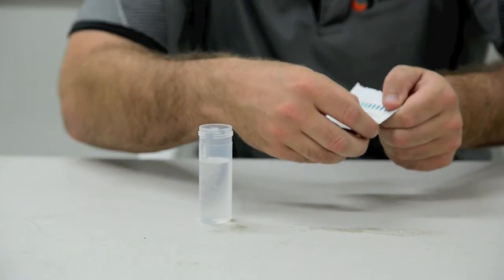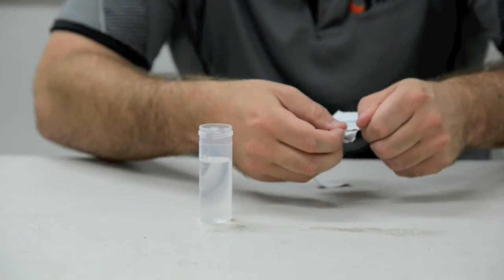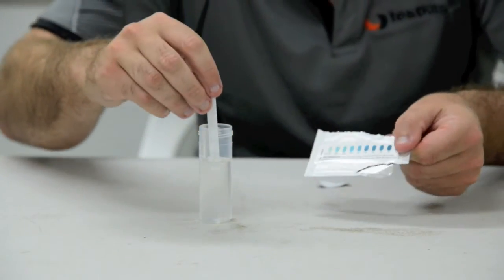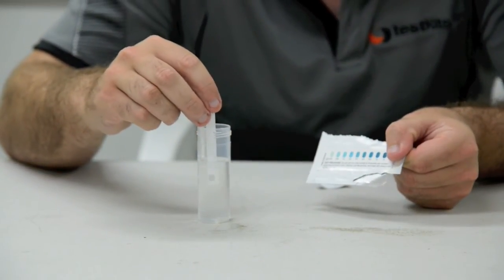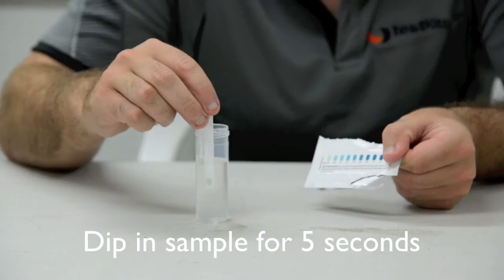To carry out our tests, first fill your sample tube with your sample water, remove test strip from packaging, making sure not to tear through the color chart.